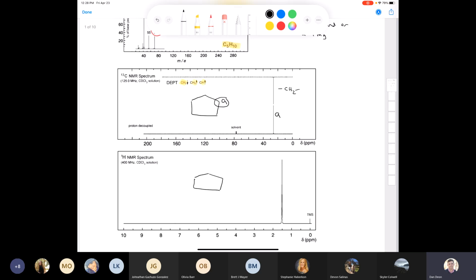And now we've annotated the carbon spectrum. The same thing applies to the proton NMR spectrum. We write A next to our singlet here, that's around 1.5 parts per million. We have our one signal, and we know that it represents these two methylene protons like this. You can put a little A by them like this, and this tells me that those are my A protons. And I know that all the other protons are chemically equivalent. And there you go. Now you've annotated a spectrum.